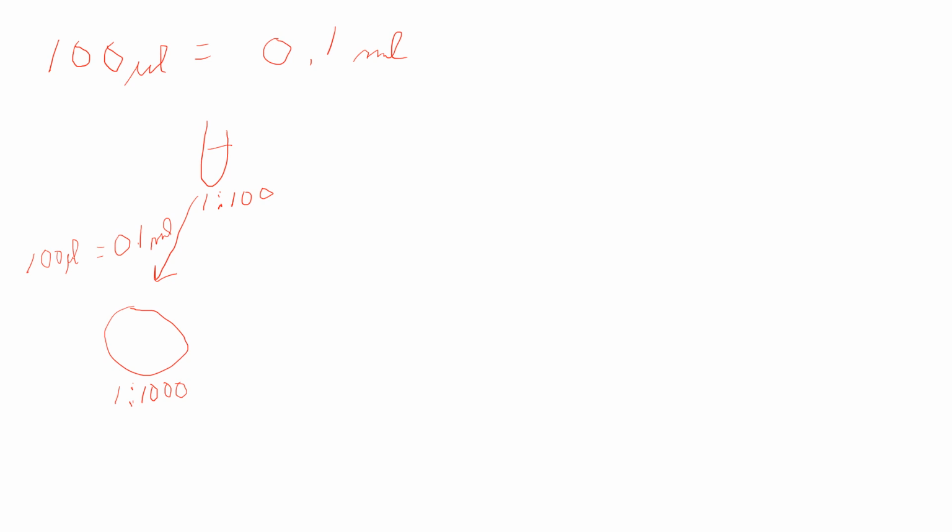This is letting you know how you figure out which one of those sets of plates you are going to use for the calibration for the rest of the experiment. You're only going to use one set because remember, we only count between 30 and 300. So you're going to have to count those and figure out which set it's coming from.